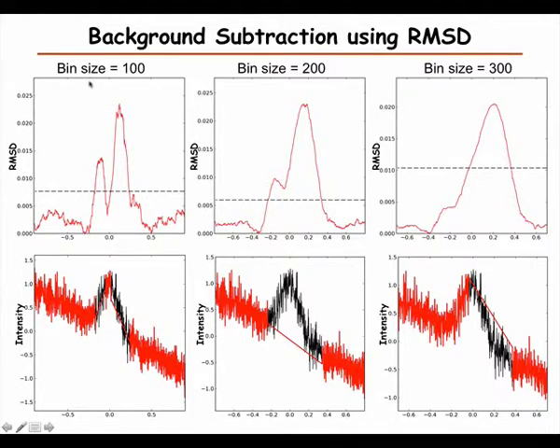Now we have to choose the bin size the right way, so that it's bigger than the peak. So probably this middle case would be the best, where over the peak we get very large values. That's over some kind of threshold that we can set, and we can define this in different ways. For example, here anything that's under this threshold is marked in red, and the peak is marked in black. So if we select this threshold, we can then remove the background.